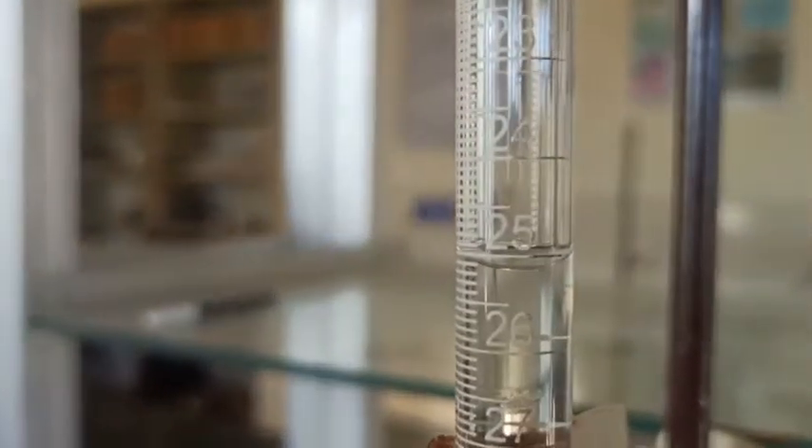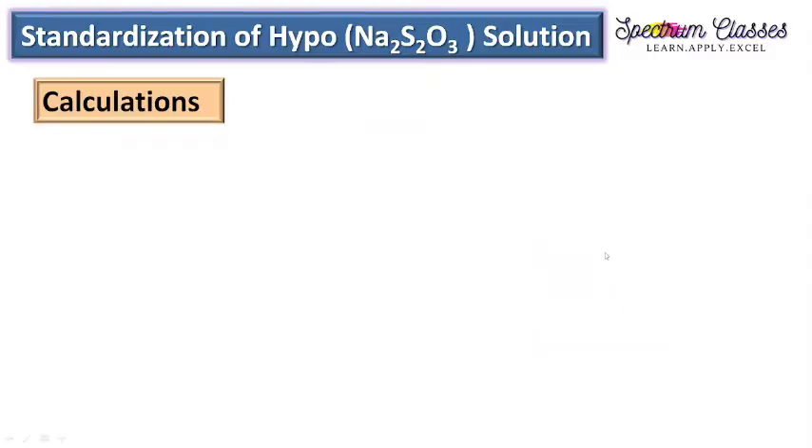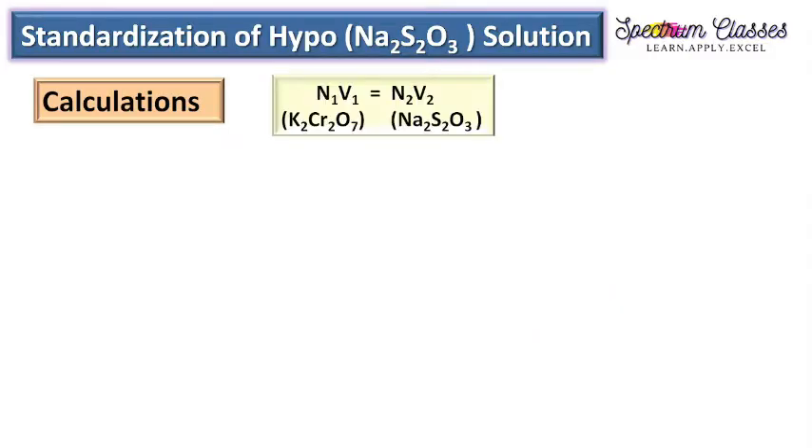Take the final reading of the burette, which is about 25 mL. In the observation table: volume of K₂Cr₂O₇ taken is 25 mL in the conical flask, initial burette reading is 0, and final burette reading is 25 mL — so 25 mL of sodium thiosulphate is consumed.